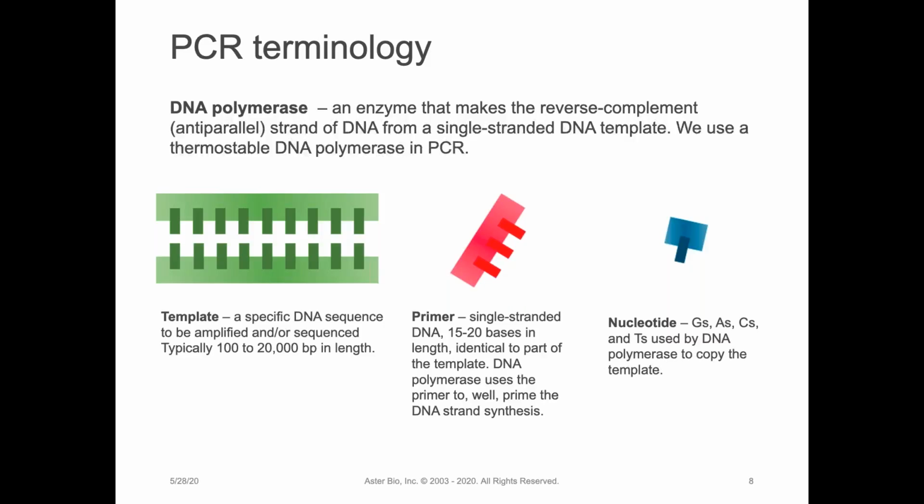It uses a couple of terms that I'd like to explain very quickly. The first is DNA polymerase. This is an enzyme that basically copies DNA, sort of like a Xerox machine. The second is template. A template is the genetic information that we pull out of the bacteria originally. It's their DNA in a purified form. Primers are very short pieces of DNA that identify the 16S gene and allow us to build more copies of it. And the nucleotides are simply the building blocks that we use to assemble new genes.